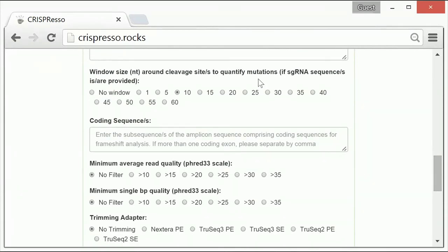The fifth optional parameter allows for creation of a window surrounding the cleavage position as determined by the provided guide RNA sequence for CRISPResso to analyze for indels. Sequencing artifacts and or SNPs can lead to false positives and negatives in the quantification of indels and HDR occurrences.